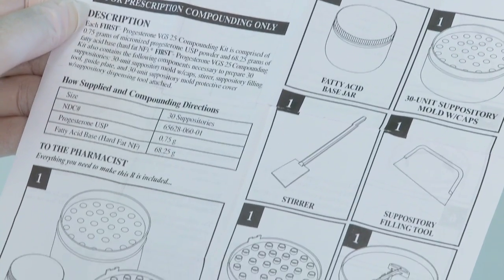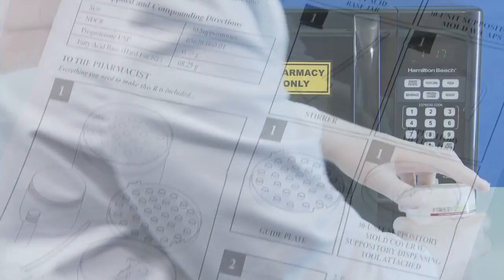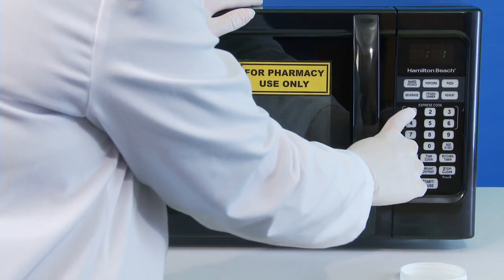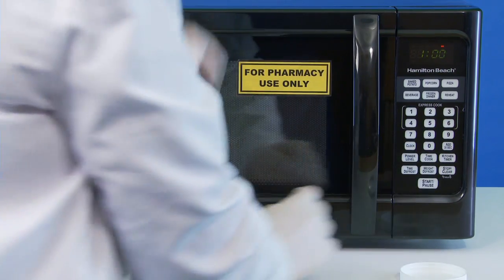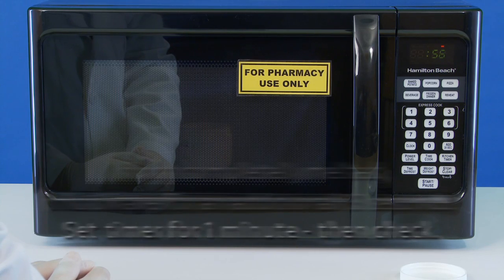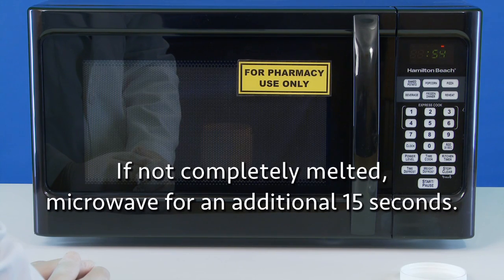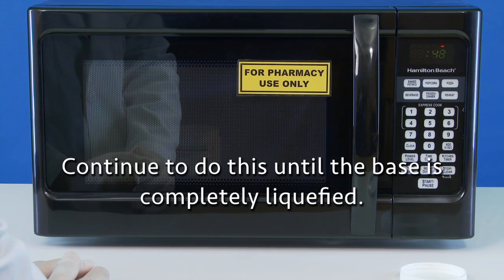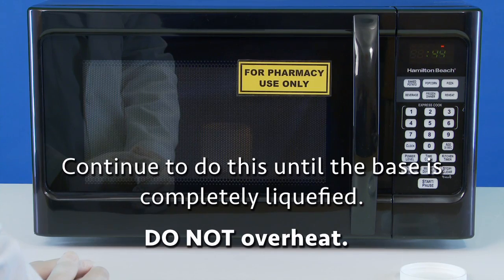The first step is to prepare the fatty acid base. Remove the cover and melt the base in a microwave oven. Depending on the type of microwave used, this will take 1 to 3 minutes. Set the timer for 1 minute and then check it. If it is not completely melted, microwave it for an additional 15 seconds and check it again. Continue to do this until the base is completely liquefied, but be careful not to overheat it.